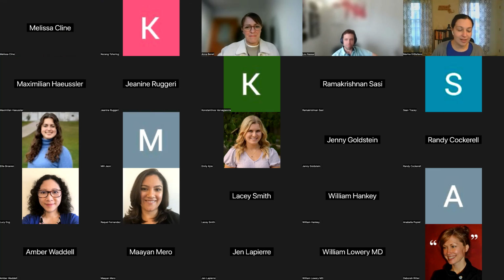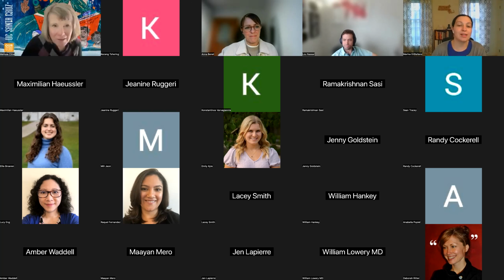That's great. And Melissa, is that just for certain, are you piloting with certain Mave experiments? Is it maybe in the cancer space first, or a large data set? The initial data set that we're working with is pretty large. It's about 90 experiments. And in time, that's going to be hooked up directly to MaveDB so that we can update it automatically as new Maves come in.